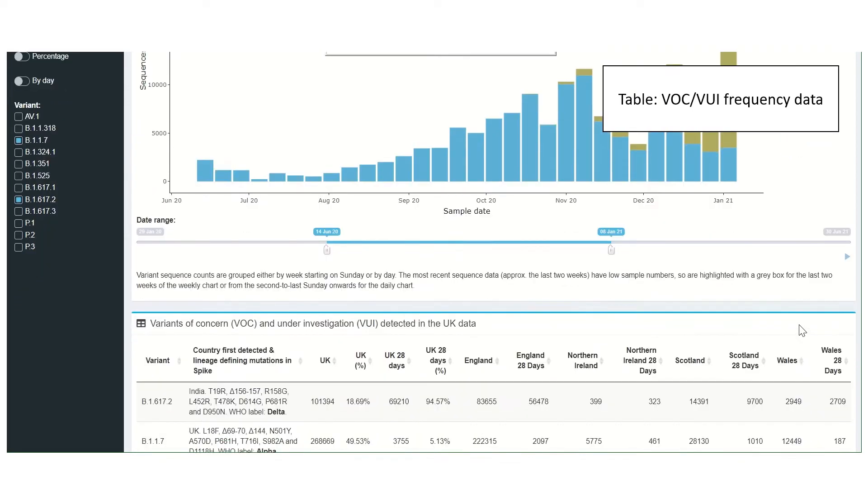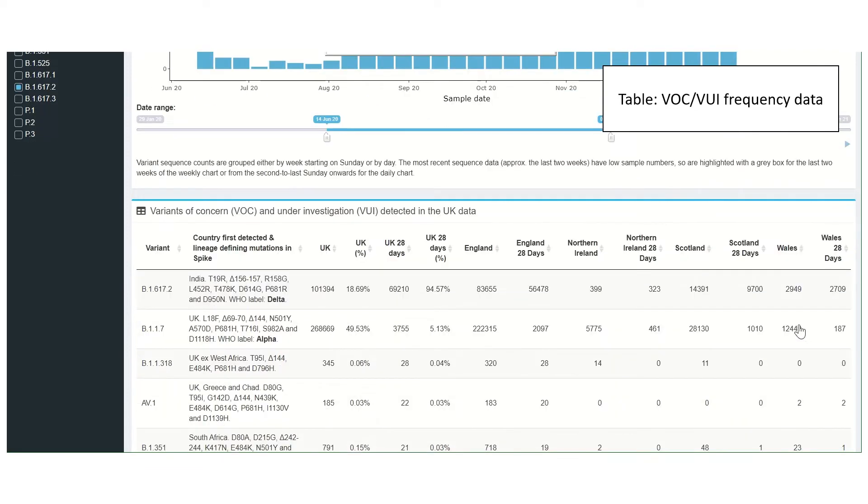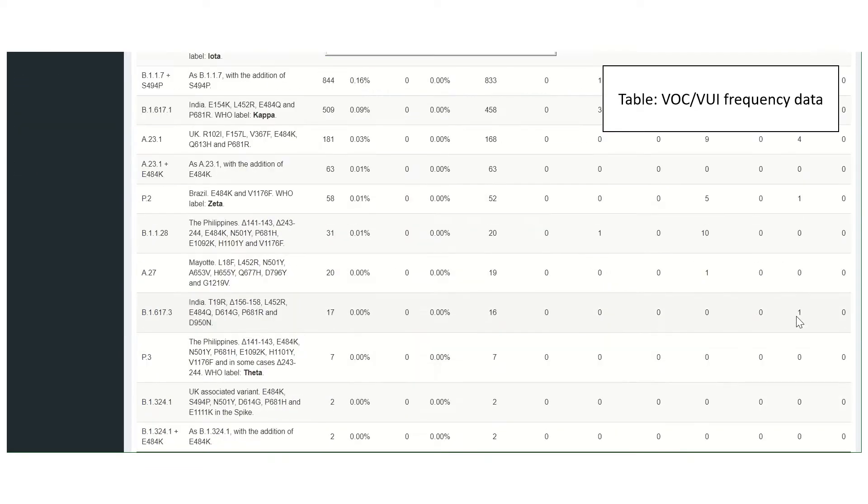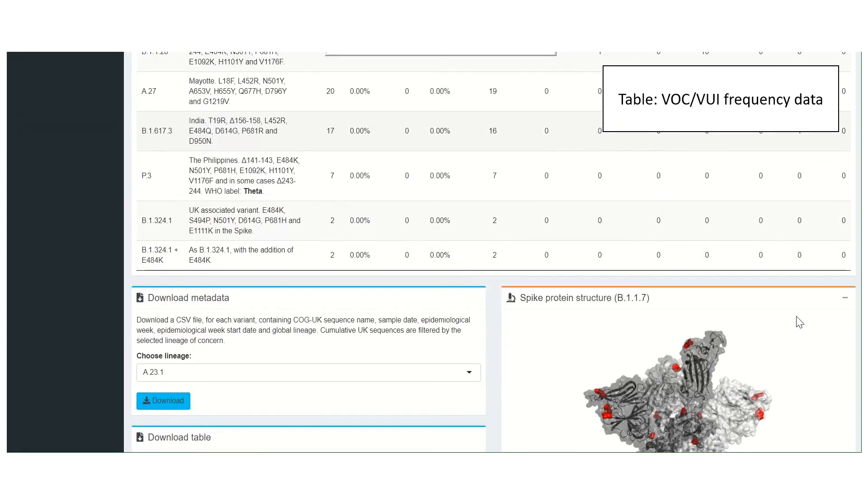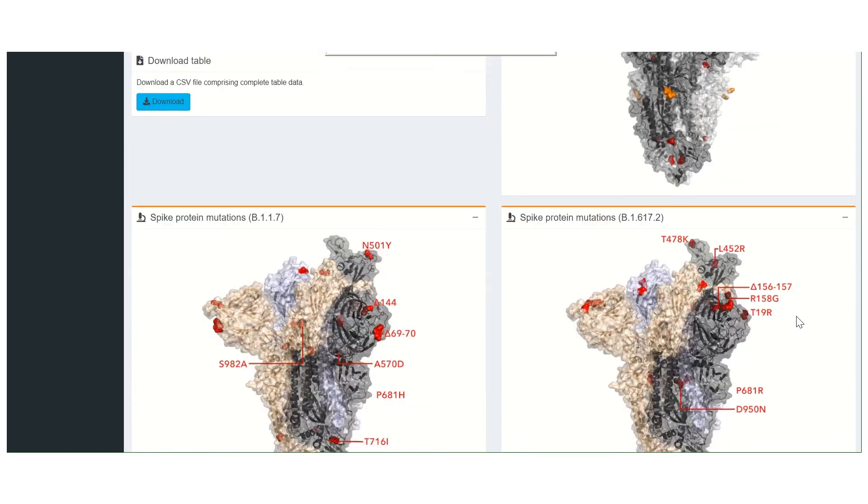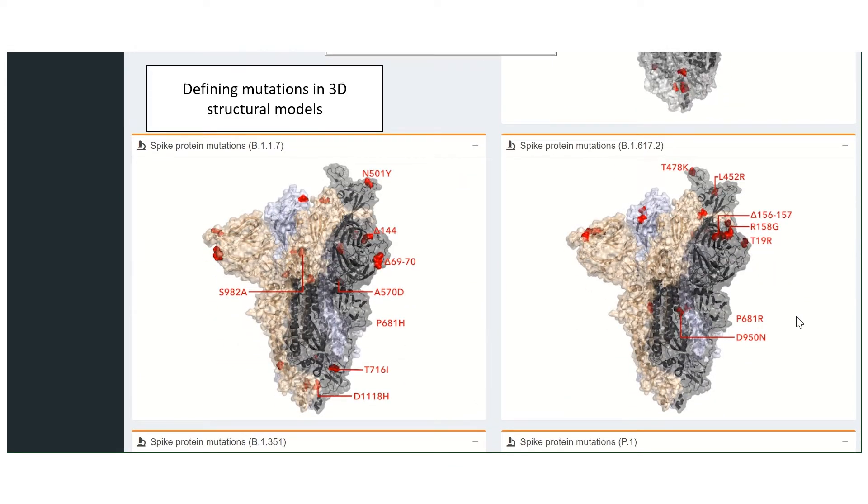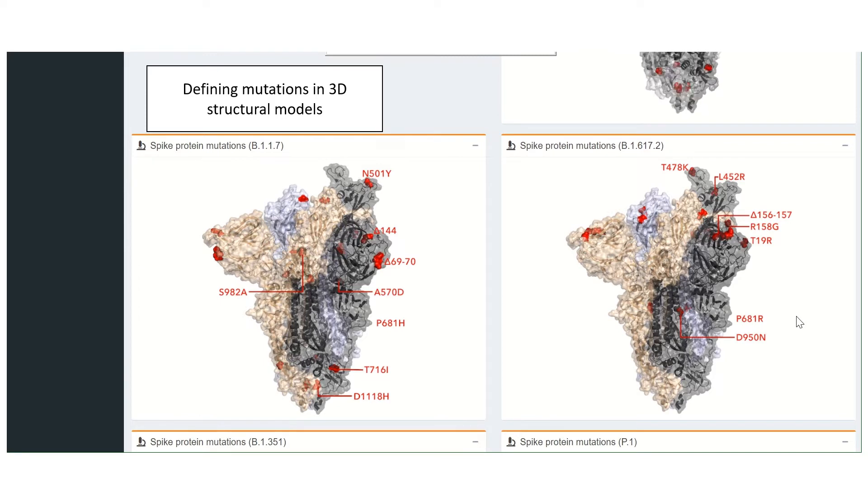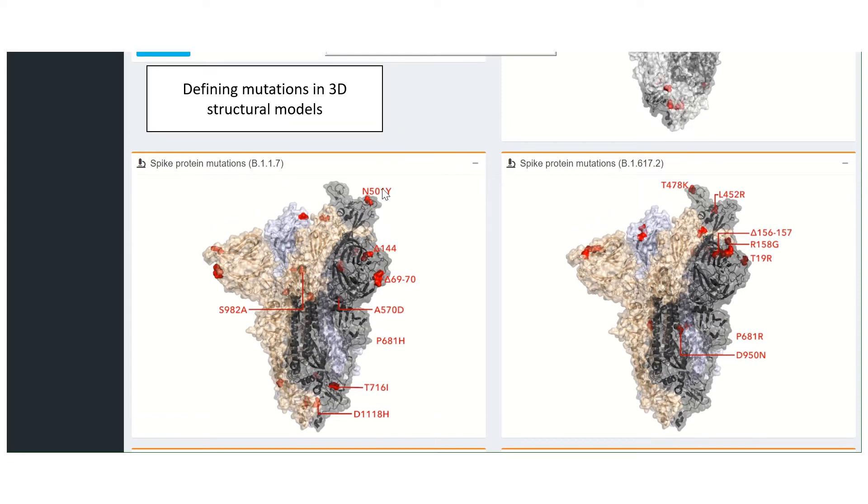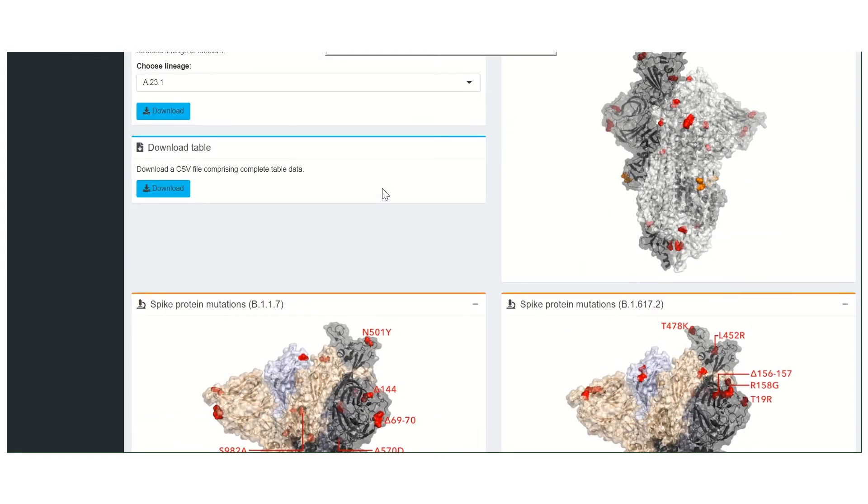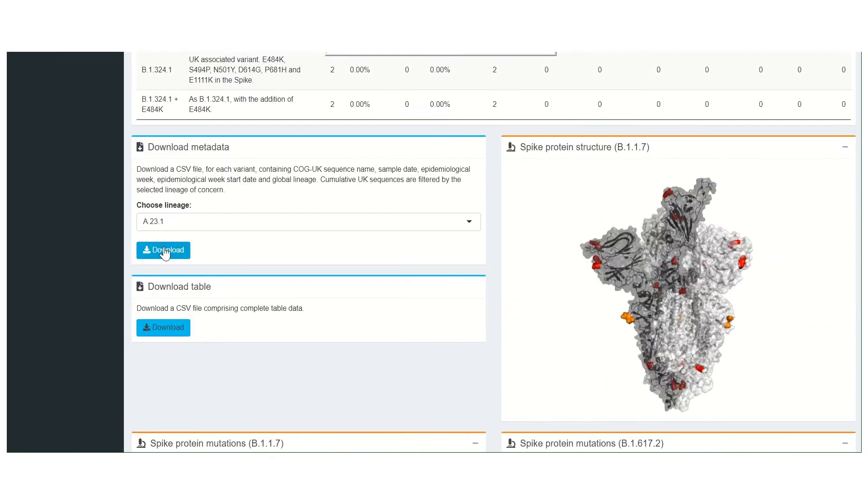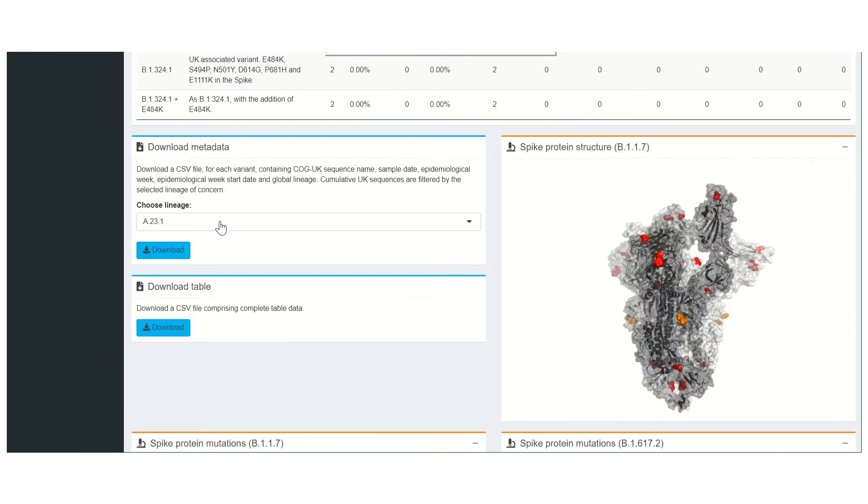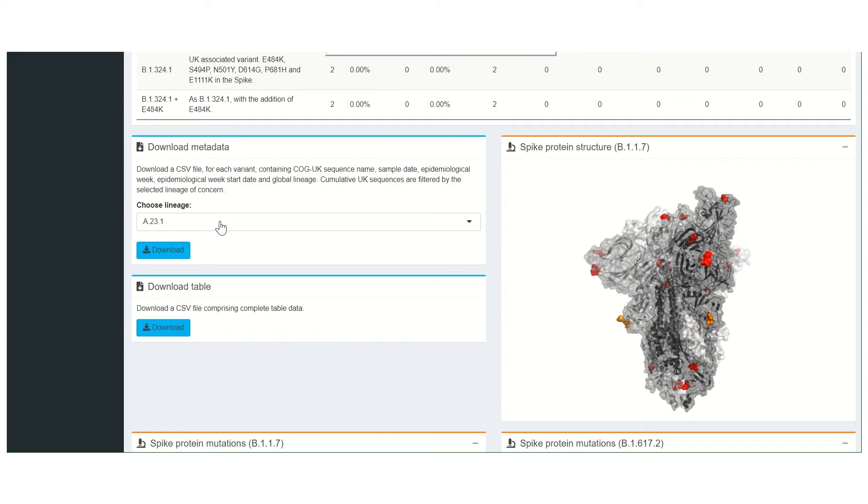Scrolling down reveals a table that displays frequency data for VOC and VUI identified in the UK. At the bottom of the page, the defining mutations of each variant are shown in the context of 3D structural models. Here we see the N501 mutation in the alpha variant spike protein. Variant metadata and the full data from the table can be downloaded from here.